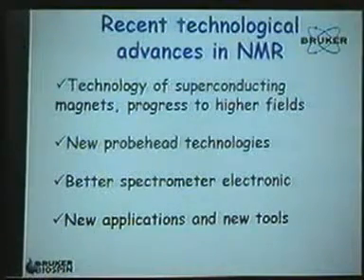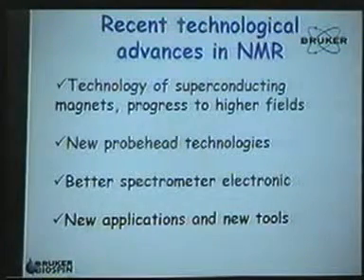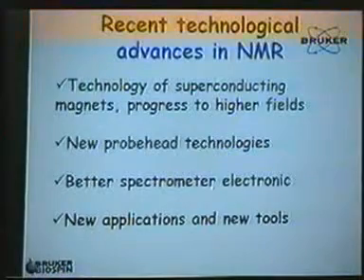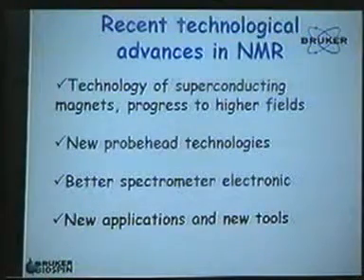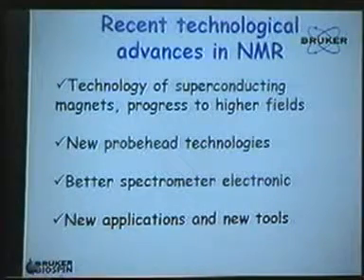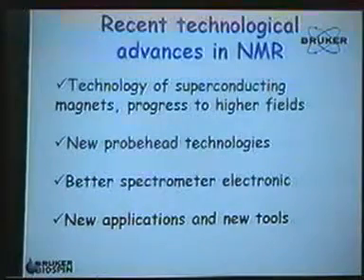So, what I wanted to discuss during this talk, and I'm almost finished. We spoke about technology of magnets, we spoke about probes, we spoke about spectrometers, and we spoke about, this is a major new application, the coupling of LC to NMR. And also, it's the application that you will be able to do here, so I thought it was very important to discuss it. Next.